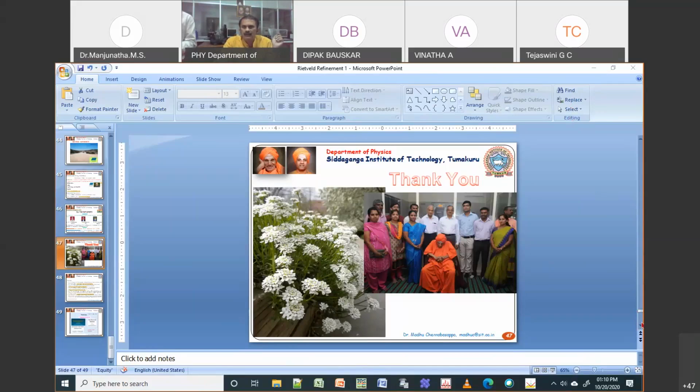Yes, sir. Sir, this is Tejas from Presidency University. I'm a research scholar at Presidency University. Thank you for giving this opportunity to learn about the Rietveld refinement, the 4-day workshop. I learned many software and programs for the Rietveld refinement, for doing the XRD analysis. Madhu sir explained everything about the XRD analysis to us in a very beautiful manner, step by step, and he kept repeating things for us.